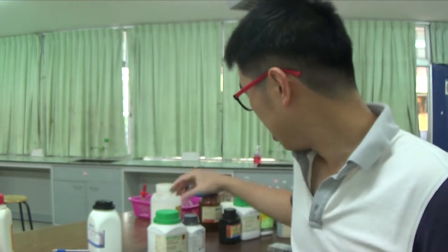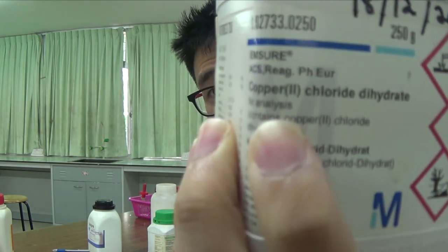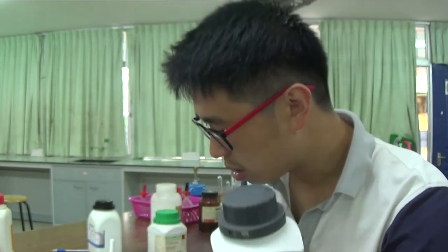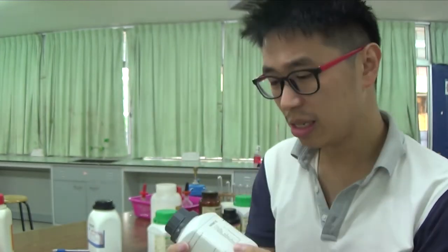Okay. There are many, many other compounds that are hydrated. So this is an example of copper(II) chloride. So Cu2+, Cl-, so it's CuCl2. This is dihydrate, meaning it is CuCl2.2H2O, like that. So there's the formula there. Not sure how clear it is on the screen, though. Don't know if it's autofocus, but there's the molecular weight given there. You can practice your molecular mass calculations on these, alright?